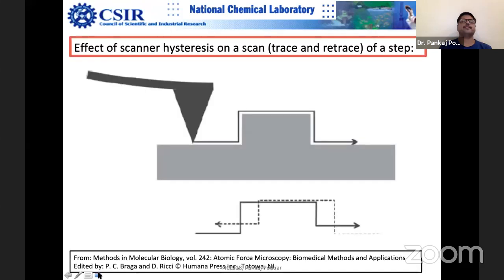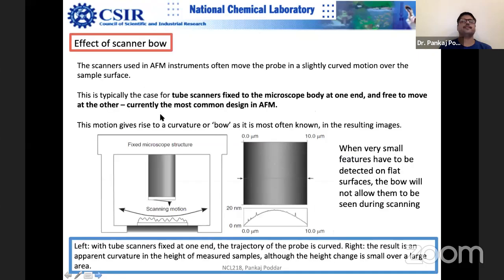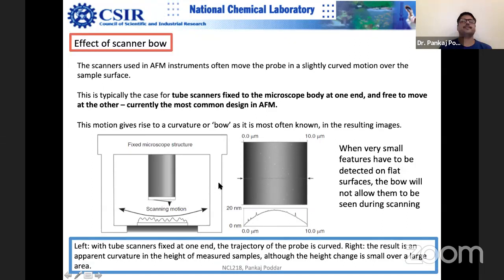Another very common problem is scanner bow. This is almost always present and can be easily fixed by offline software. The scanner is typically a piezo tube fixed from one side — when you apply voltage, it moves like a bow rather than a straight line. So in the image, you see darker regions at the two sides and brighter in the middle, with a hump-like profile overlapping your actual sample features.